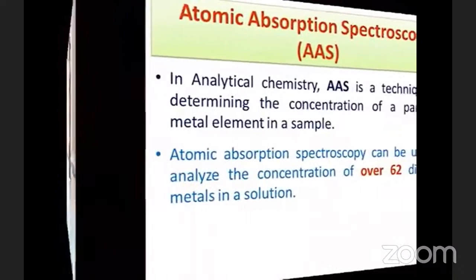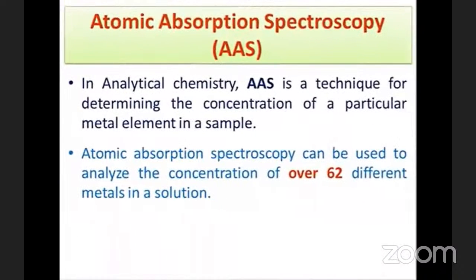Let us see what atomic absorption spectroscopy is. What is atomic absorption spectroscopy? Atomic absorption spectroscopy is the study of absorption of radiation by the ground state atoms when a sample is introduced into a flame.